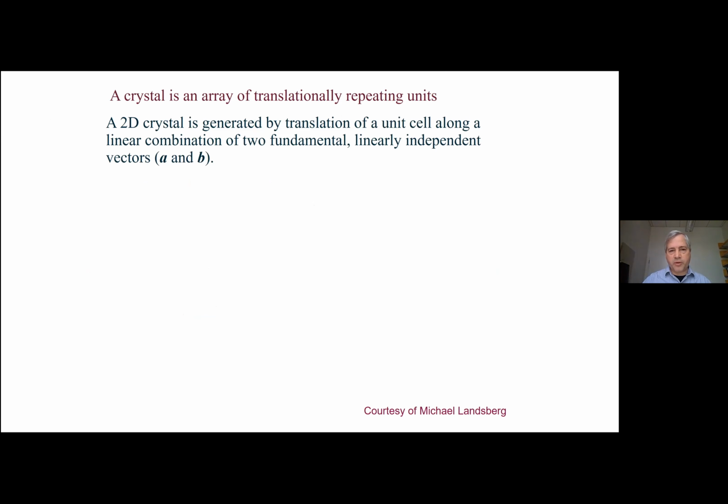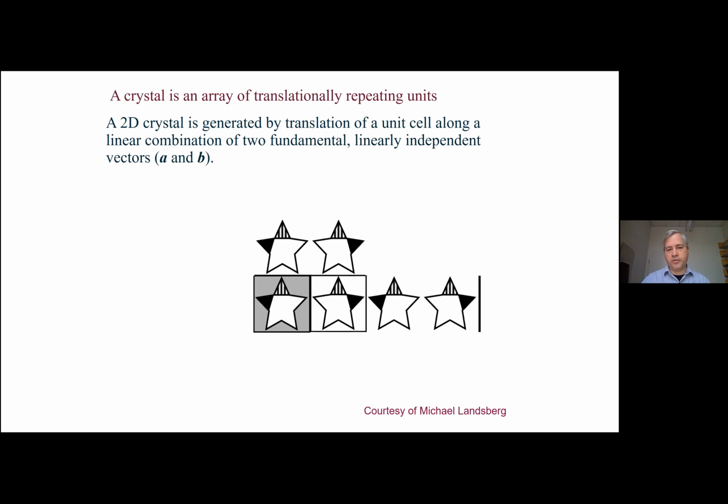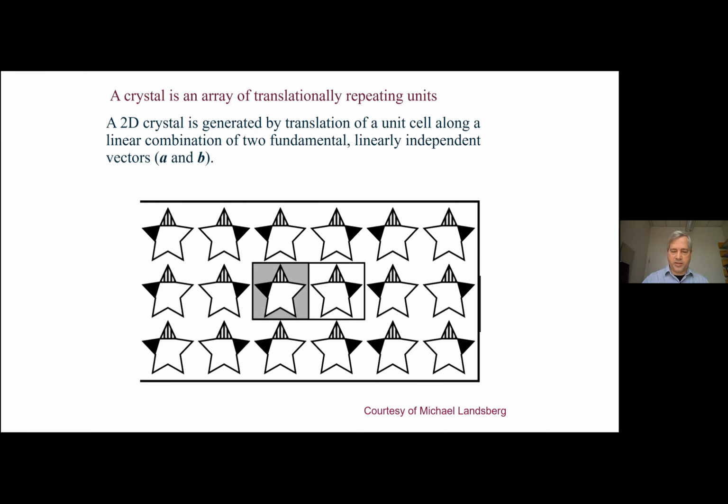So 2D crystals is basically just like you have a fundamental unit in 2D. In this case, there's this star, and they may associate with itself by flipping. There might be one next to it that's flipped, so you'd have a protein that's pointing up and a protein that's pointing down, and then you sort of get repeating units of that, and that's basically what forms a crystal.